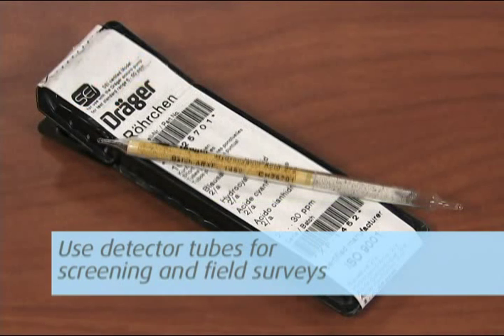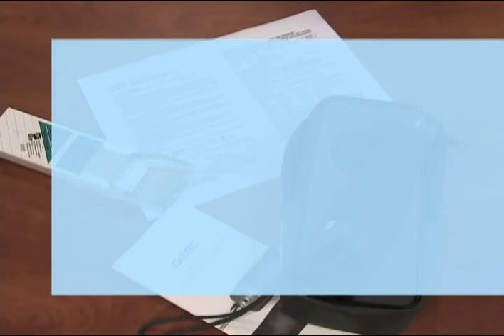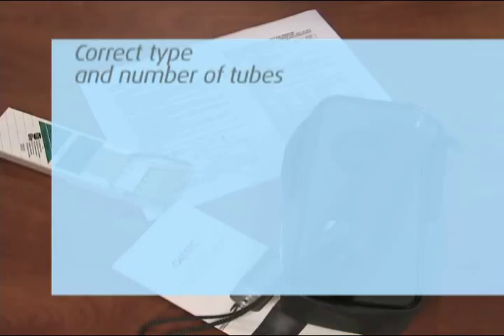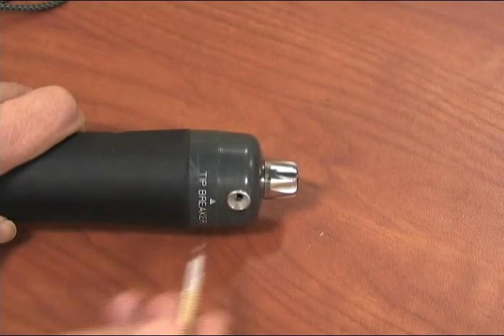Use detector tubes for screening and field surveys, and use validated methods for compliance sampling. On receipt of your sampling kit, you should have the correct type and number of tubes, instruction manual, GV 100 piston pump, and case.